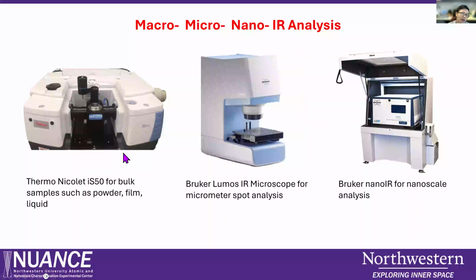And in our lab, we have the Thermo Nicolet iS50. This is for bulk samples, like powder, film, liquid. We also have a Bruker Lumos IR microscope, and we also have a Bruker nano-IR for nanospot analysis.